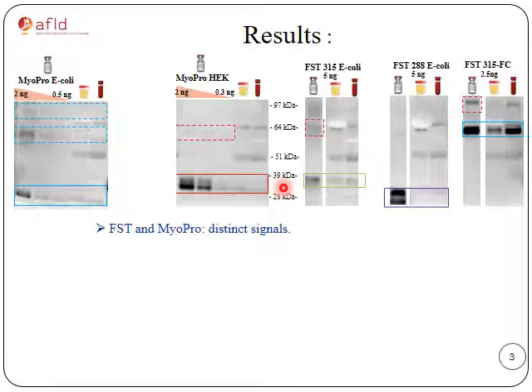In the spiked serum and urine, the bands corresponding to the standard profile were detectable and unchanged in serum and urine, except for follistatin 288 from E. coli. The second band was not found in the urine or in the serum.